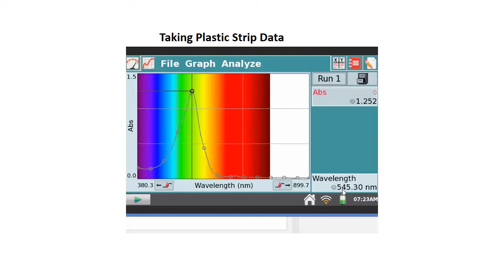Now what we want to do with that is pick out a place on this spectrum where the absorbance is on the order of 3/10 to 4/10, somewhere in there. So I'm going to click somewhere around, this is split up as 0.5, 1.0, and so on.